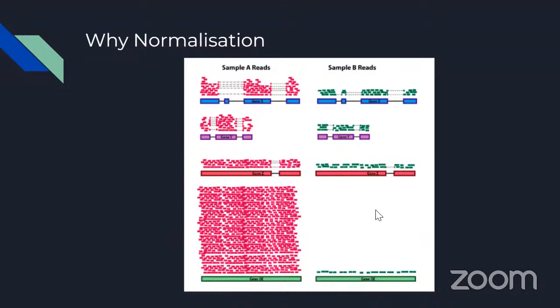If you don't consider this particular gene DE, when you compare gene X across sample A and sample B, we can see a lot of reads, with sample A generally having a lot more reads than sample B. With a rough comparison like this, we could say that gene X could be upregulated in sample A and not sample B. But overall, the coverage or the depth of sample A is greater because it has a very high number of reads compared to sample B.